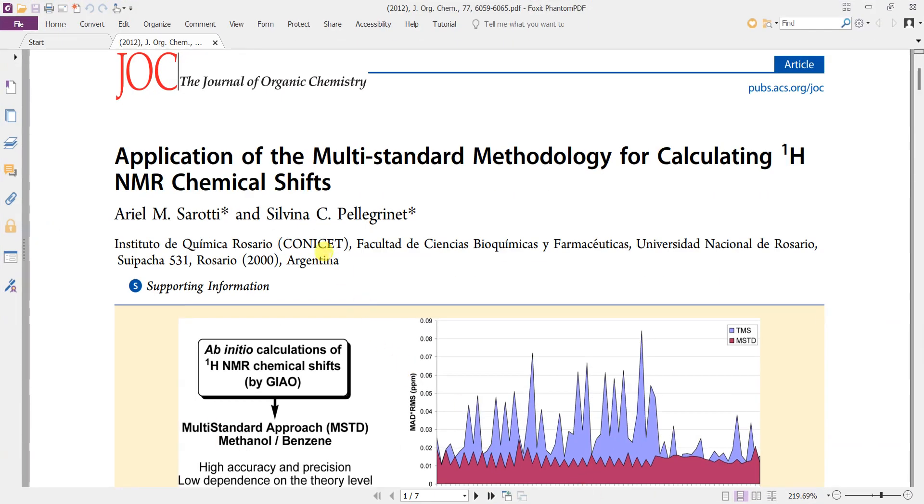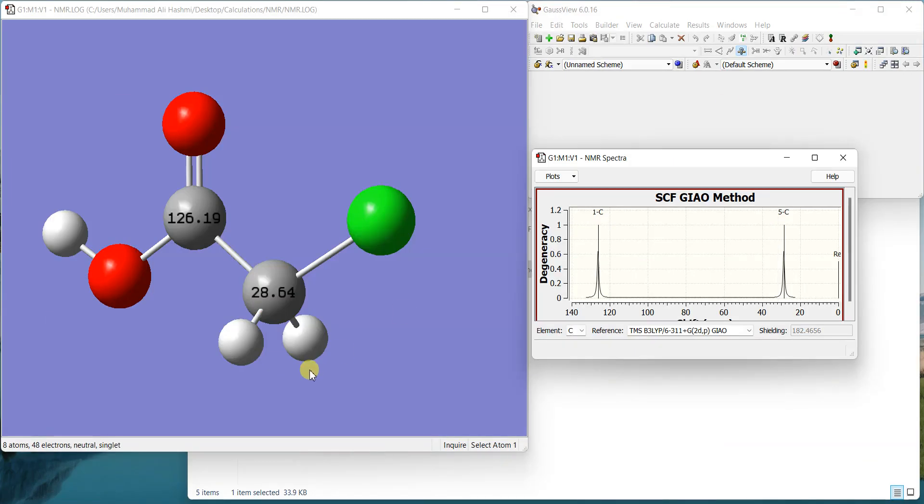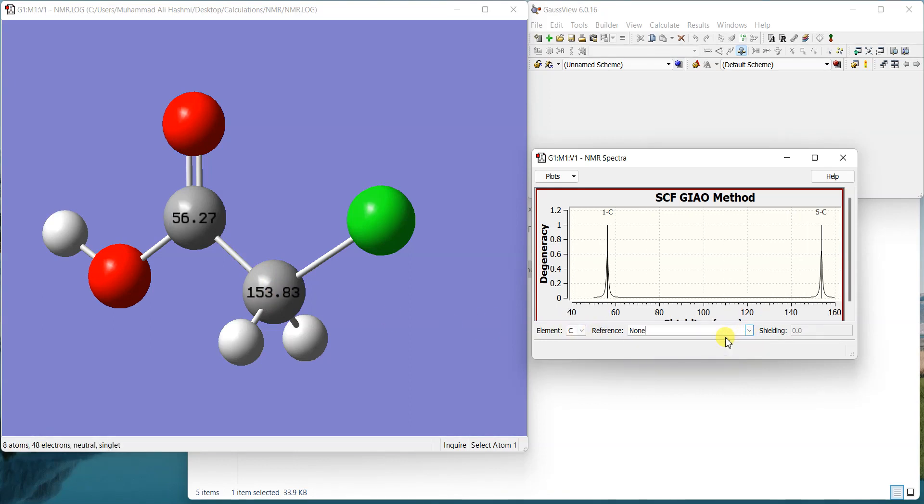I'll show you here. This is about application of the multi-standard methodology for calculating proton NMR chemical shifts. In this article the authors have told about using methanol or benzene as a reference standard and then they told that you can use different standards in the same calculation, like you can use benzene for the sp2 carbons and methanol for the sp3 carbons and that would give you good results. You can give it a read and apply it as you like but I'll show you how to add these shielding tensors and get the chemical shifts while still referencing with methanol or benzene but not TMS.